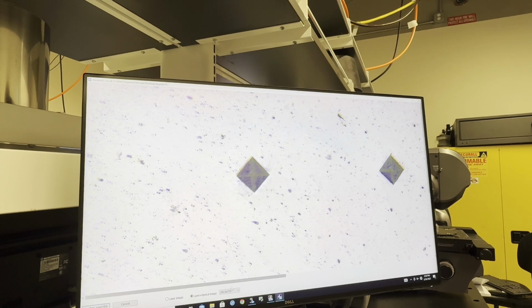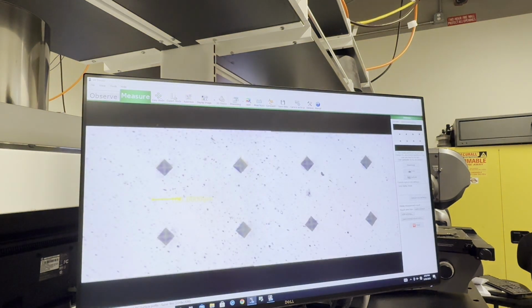You now have the option of increasing the image resolution or decreasing it, depending on how large you want your image to be. This will also contribute to increasing the quality if you increase the resolution. Once the image is processed, it will pop up in the microscope application and a scale will pop up. You can move this wherever you want. In most cases, we want to move it in the bottom right-hand corner of the image.